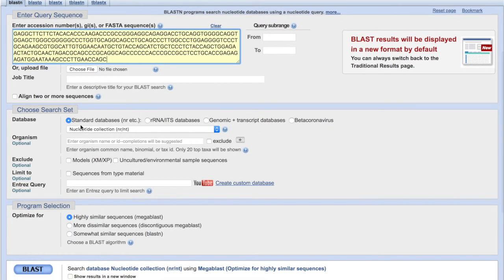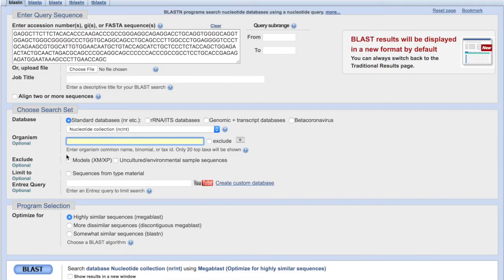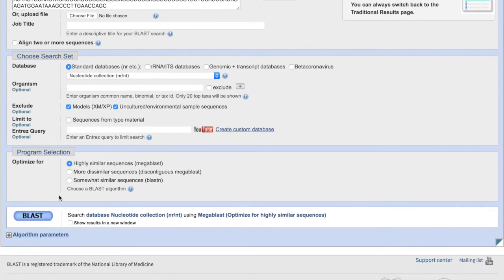The fields below the search box allow you to set parameters for your search. Select the standard database, the nucleotide collection. Leave the organisms field blank and exclude models and uncultured or environmental sample sequences. Optimize your search for highly similar sequences, then click BLAST.